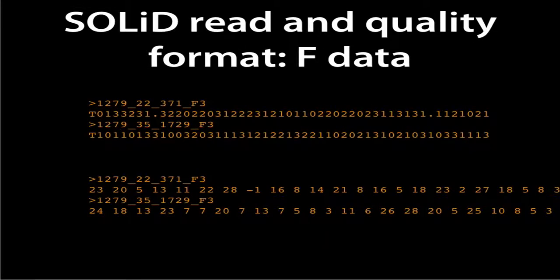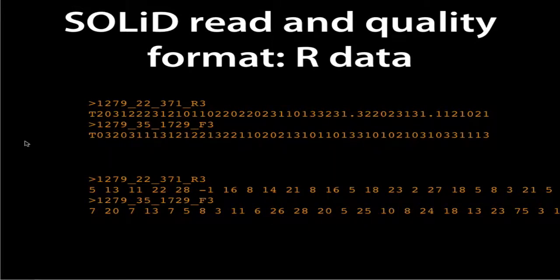So when you do sequencing, when you get mate paired reads from SOLiD instrument, you essentially get two sets of files. The first set of files is for the first mate, and these are typically indicated by F3 right here. And you get reads and you get qualities. And the second set looks very much the same, but these are the second mates or R3 reads, as you can see here. So both of these, forward and reverse, are color space reads and qualities in this format.